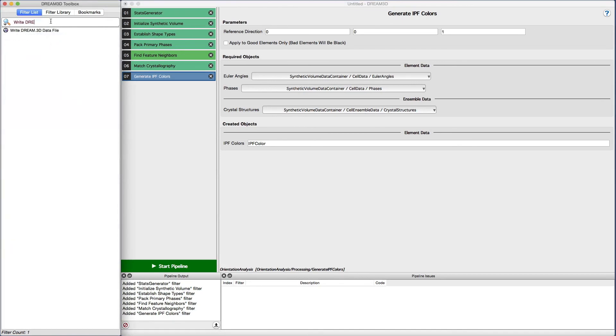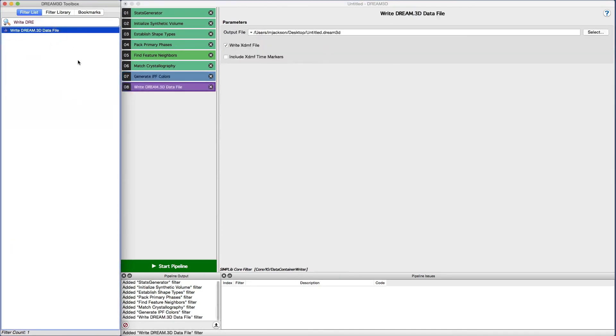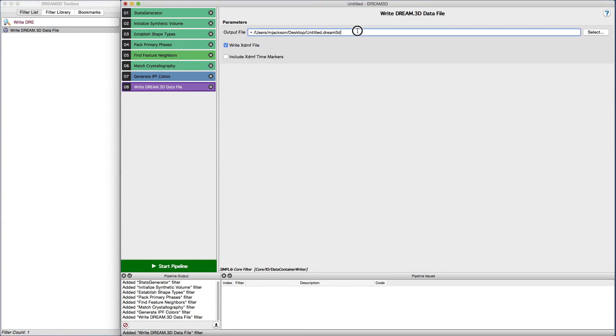Lastly, we insert the write Dream3D data file into the pipeline and set an output file.